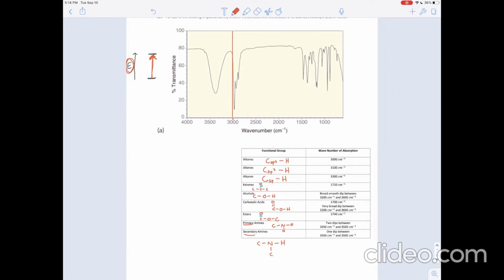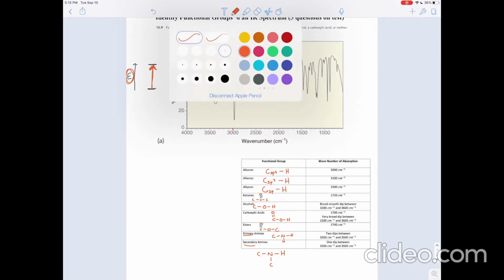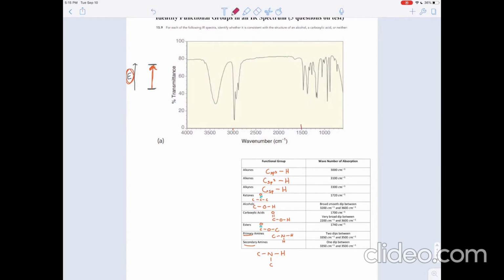different shadows that are cast in these IR spectra. The first thing you ever want to do when you come into contact with an IR spectrum is draw a line at 1500. Everything to the right of that line, all of this stuff, you'll notice there are a whole bunch of crazy peaks there. Those are all the single bonds in the molecule.